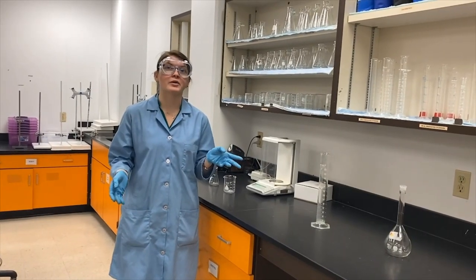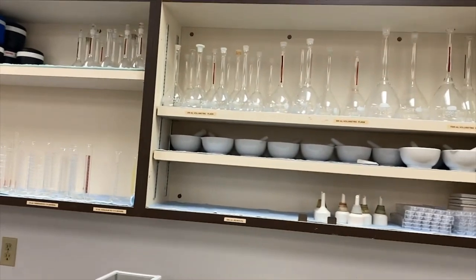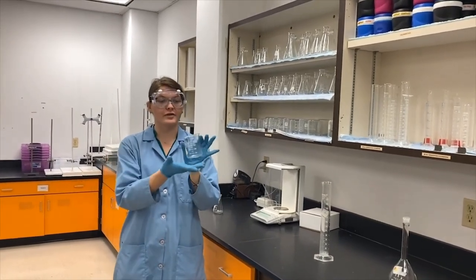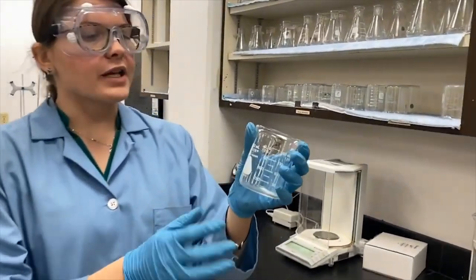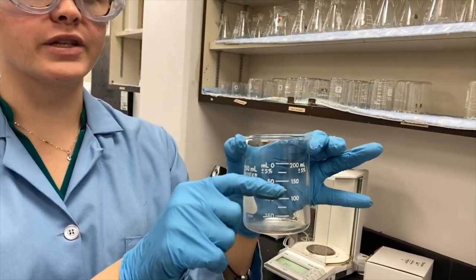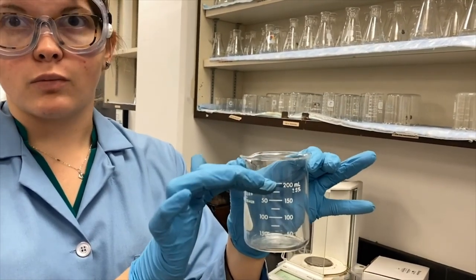Before we get started in the experiment, I'm going to go over the different types of glassware we have. This is our glassware cabinet. We have many different sizes and shapes, but I'm going to show you the basics for right now. The most simple piece of glassware is the beaker. With all glassware, they have the size of that glassware, but also the maximum graduation they can go up to. Each line that you see is a graduation. This is a 250 milliliter beaker, and we can fill it up to 200 milliliters actually measuring.